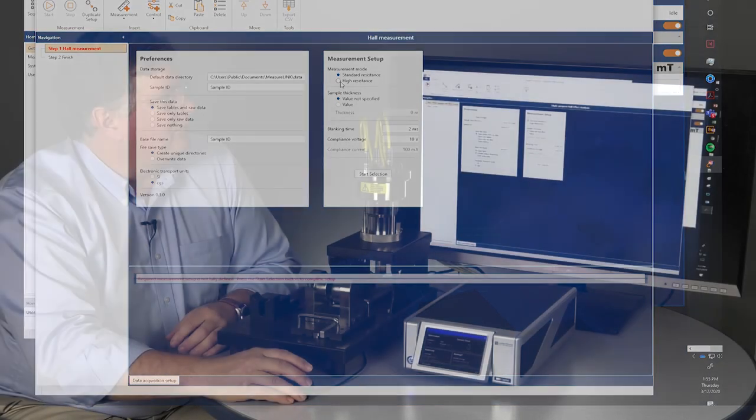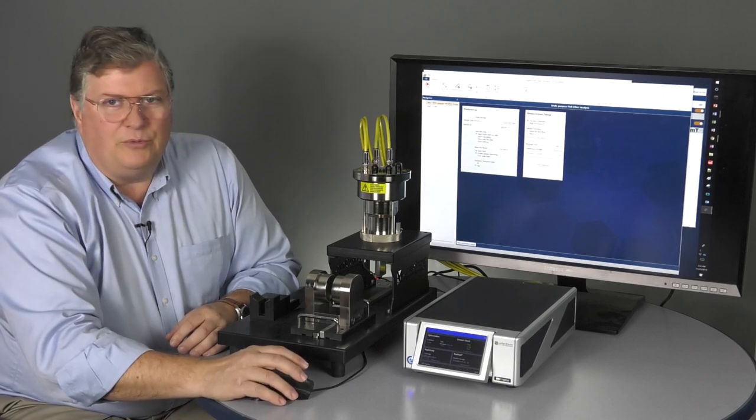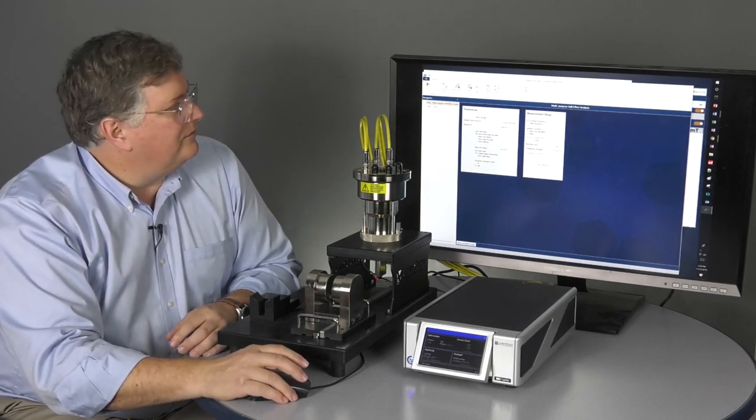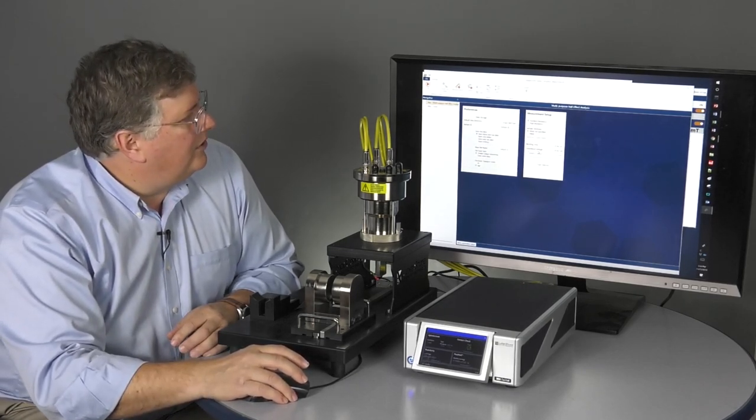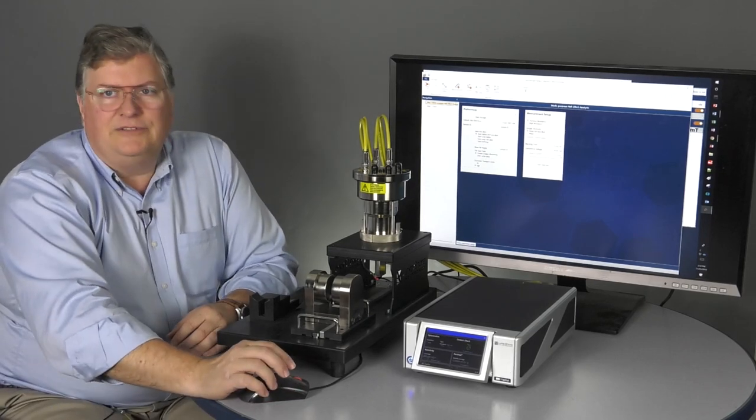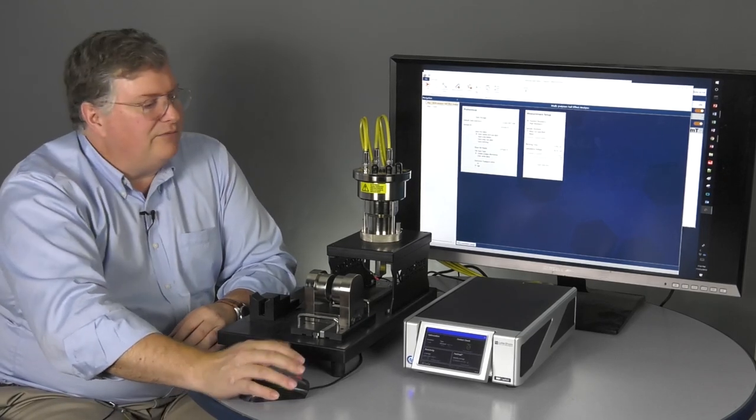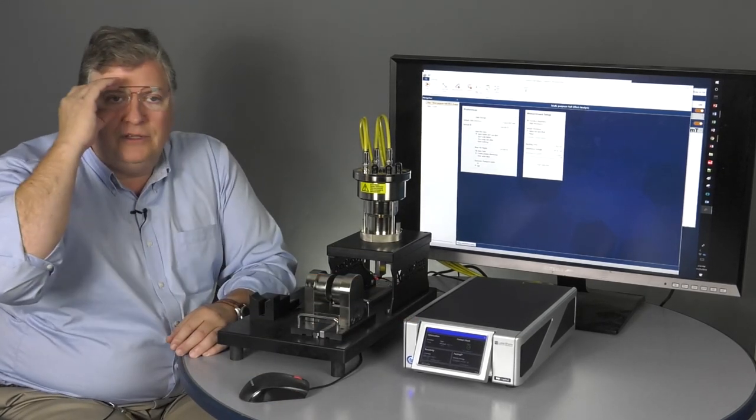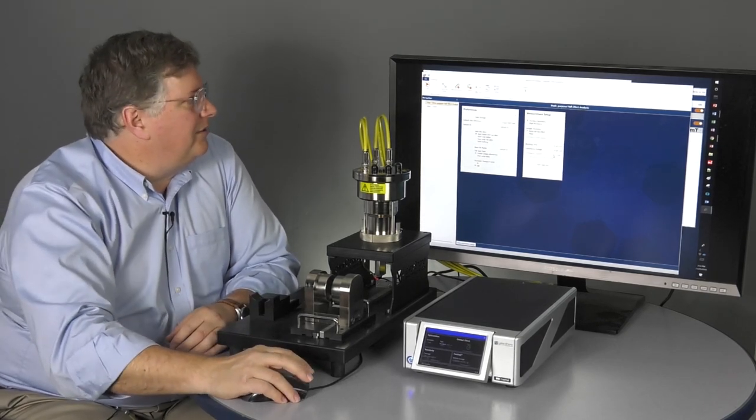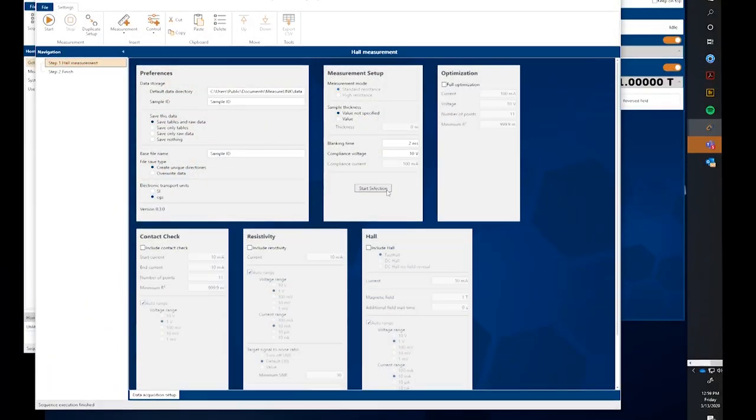In standard resistance, standard mode, we're sourcing current and measuring voltage. I just wanted to have a compliance voltage there. 10 volts is the maximum for the M91, but you can set in a lower voltage if you're concerned about your sample. So, do all that and then hit Start.